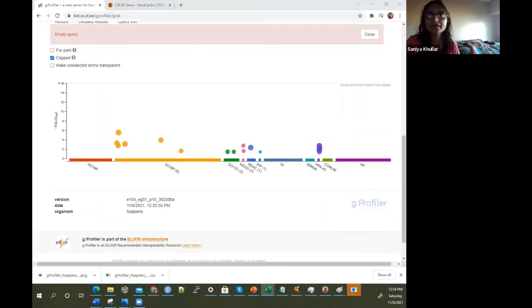I also want to show you another example. I have this Entrez ID file, and I want to show you what happens if you take another gene list — you might want to see how the results can change based on the gene list that you input.